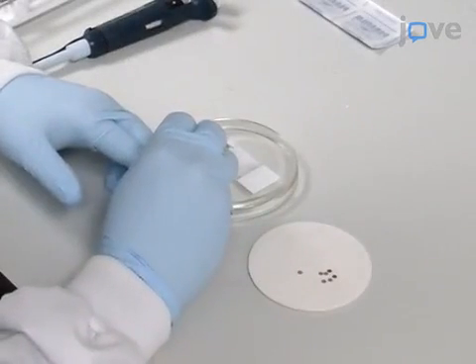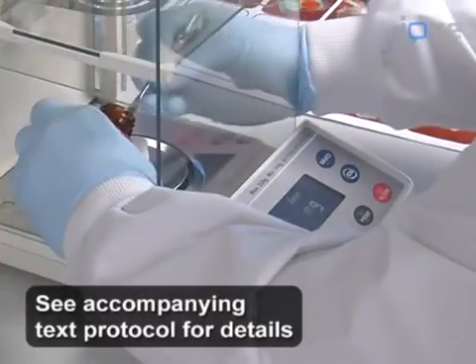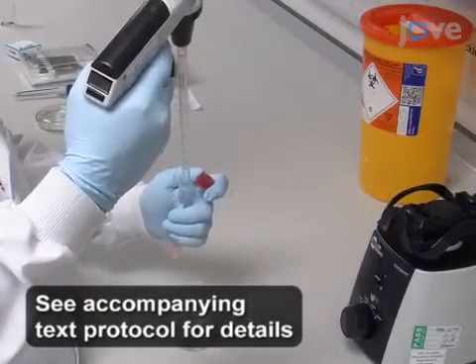To begin, prepare the EM grids using the carbon sheet method and prepare the negative staining reagents as described in the accompanying text protocol.